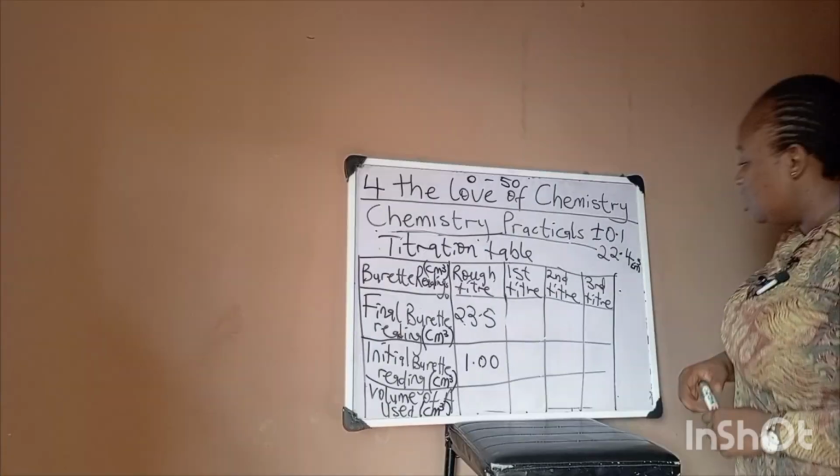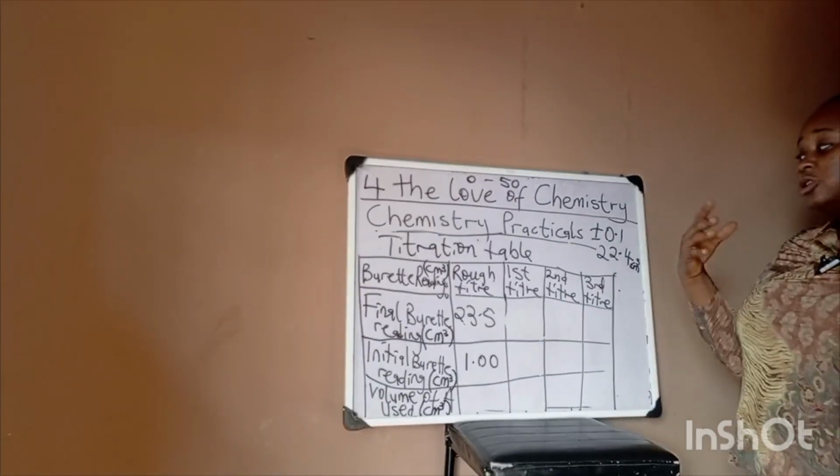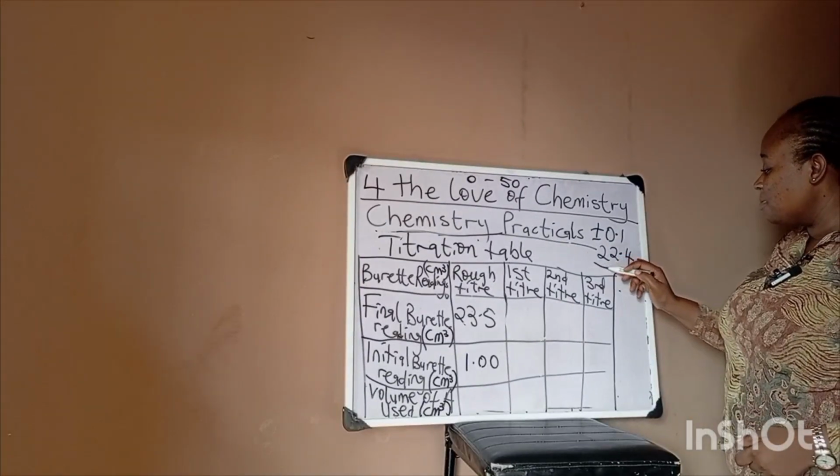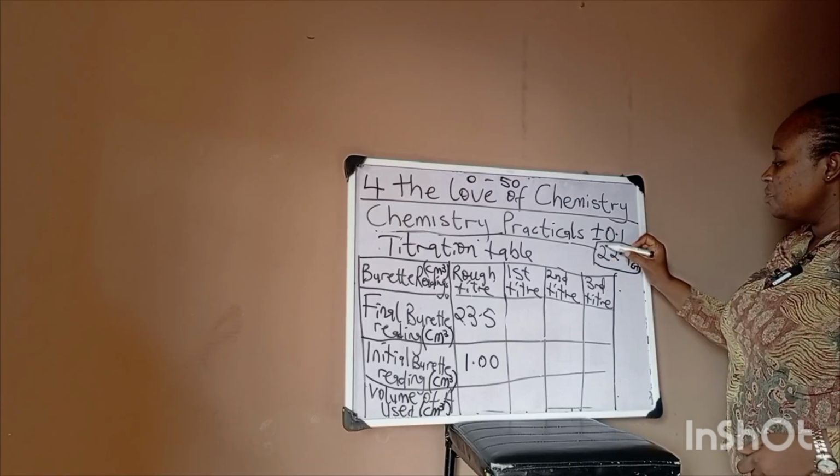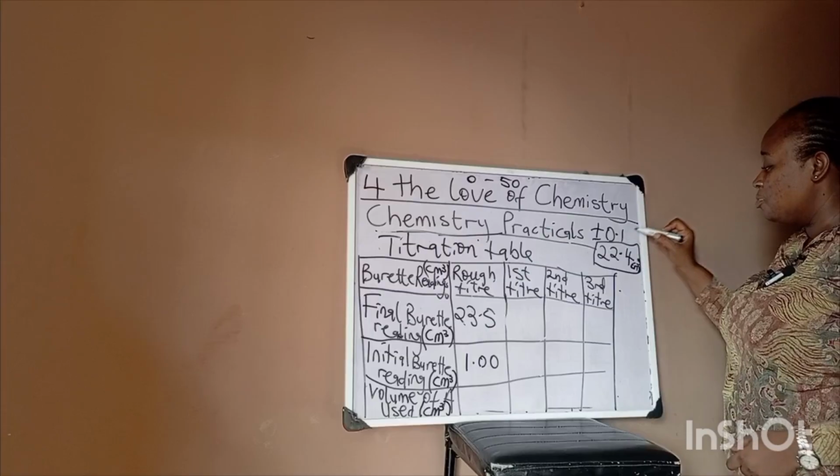Remember that what we are trying to do is to get something that tallies with this and within a range of plus or minus 0.1.